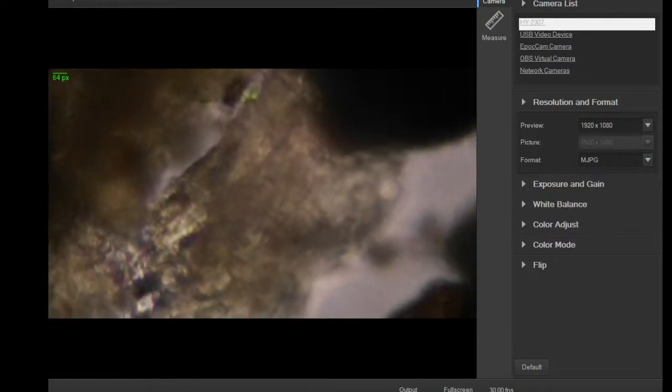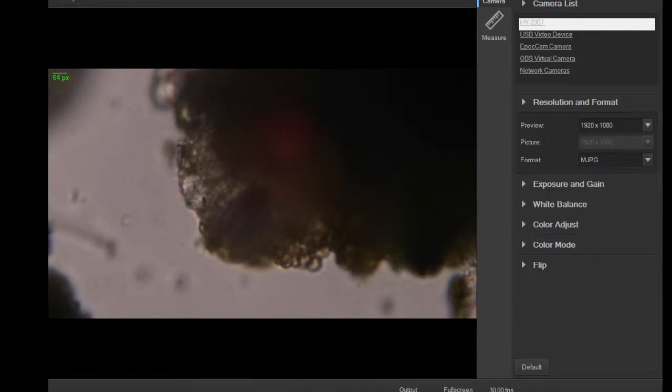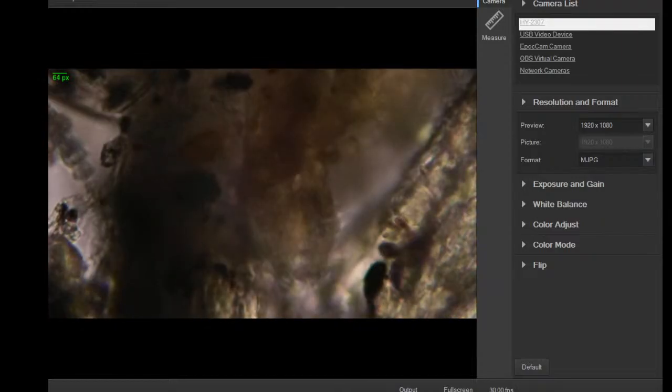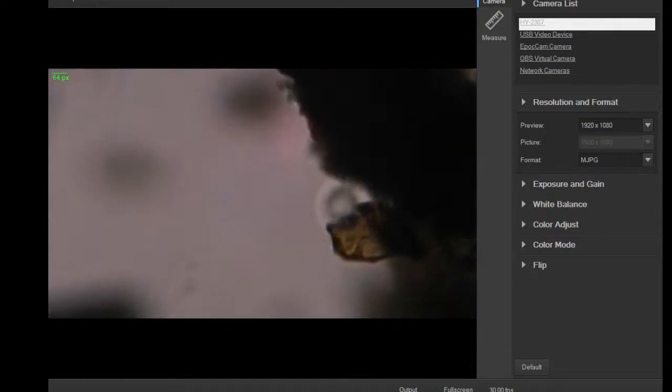This becomes the difficult video game of focusing and driving in two axes at once. Oh, it's right down there. No, no, no. Oh man. There we go. Not quite cooperating. So much debris here. One time I got a really nice shot of it on the edge of something. It was just hovering. No blockage, nothing behind it. It was a perfectly clear shot. You could actually watch the contractile vacuoles pumping, keeping the cell from exploding.